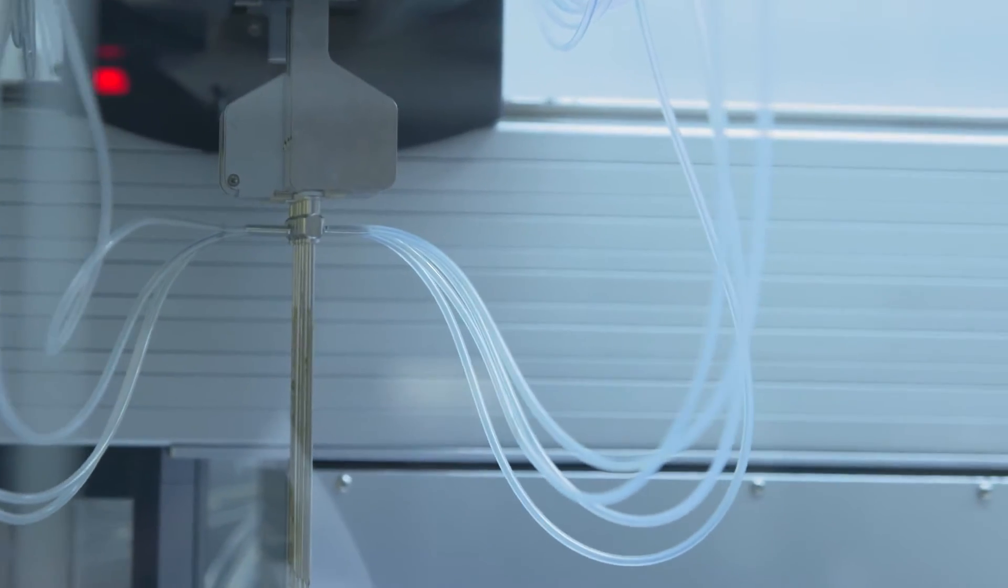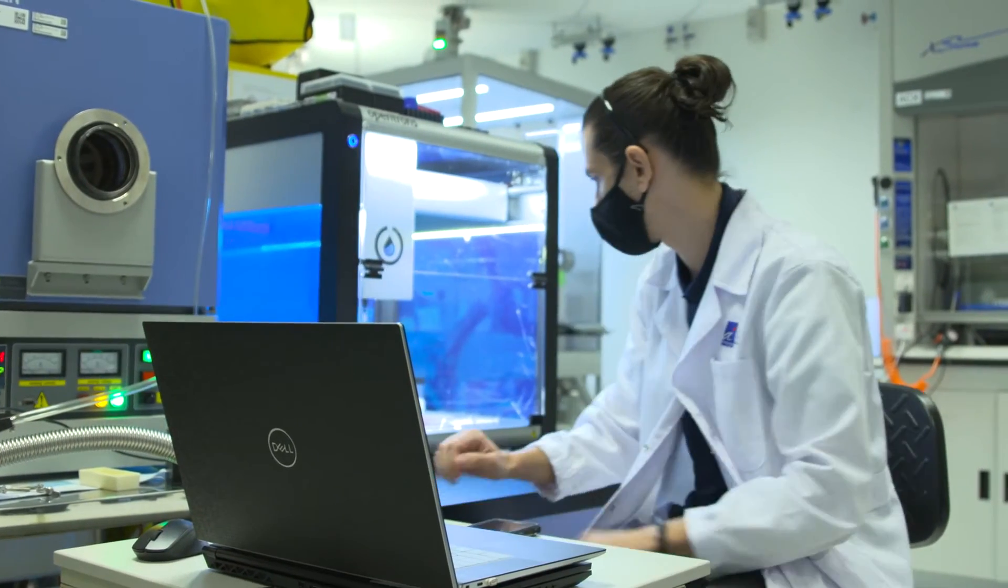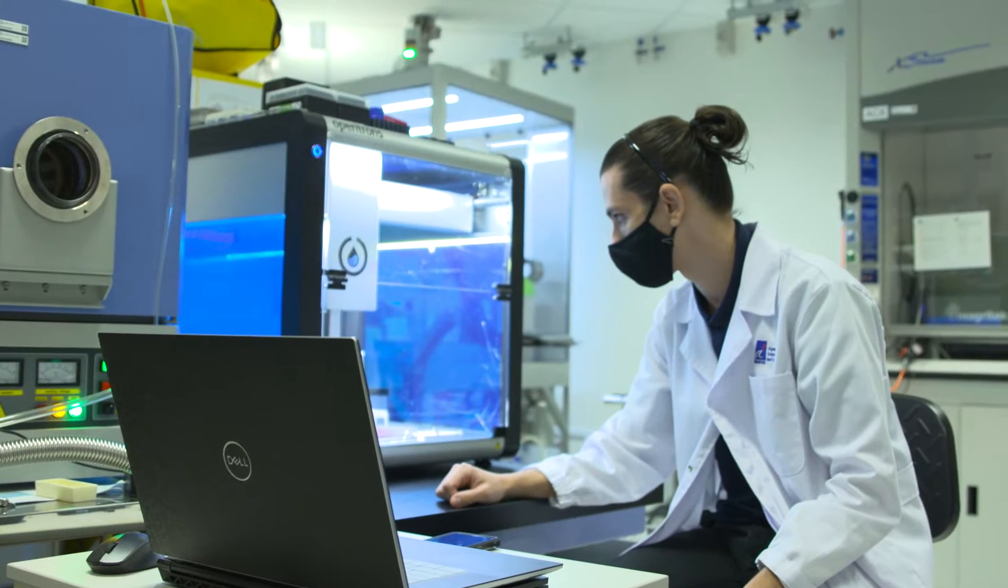We have to help the robot to be accustomed to a wide variety of materials processes. It saves us time, it saves us man hours. In a material science lab, research lab especially, we do one million things once. And so things change very quickly and our hardware has to keep up with that.